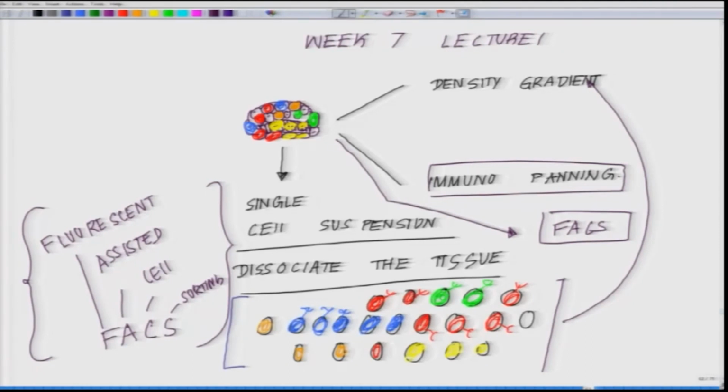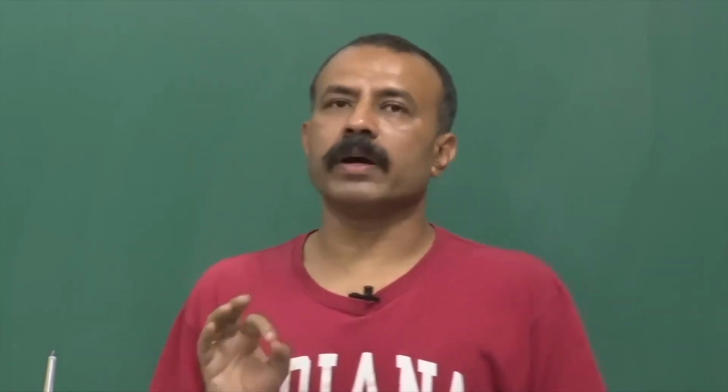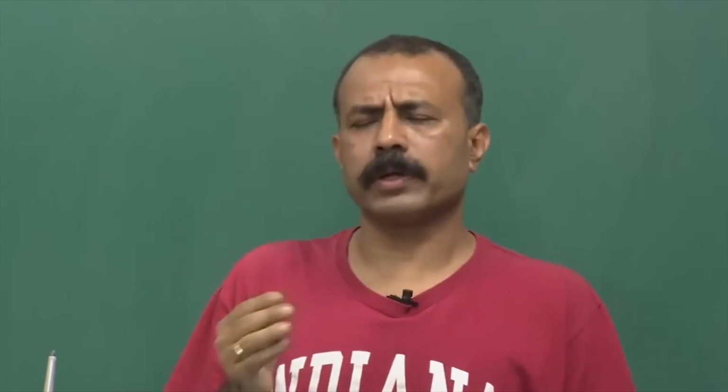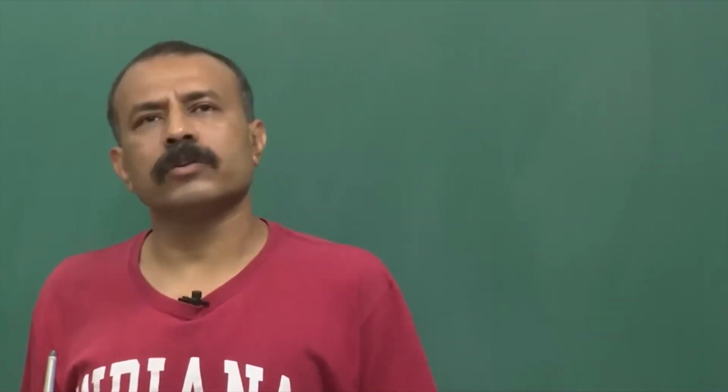Even before getting into any kind of study on FACS, try to understand the basic fundamental logic of what is happening. So, say for example, you are going to a stadium to see a match. There are say 1,000 people.